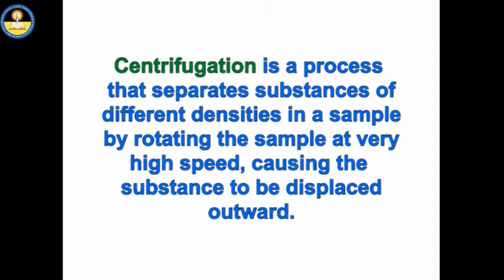Centrifugation is a process that separates substances of different densities in a sample by rotating the sample at very high speed, causing the substance to be displaced outward. Let us perform an activity to prove this.